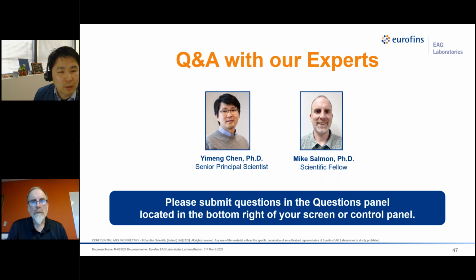So Atom Probe data acquired from pure or close to pure metallic samples contains some degree of crystallography information, but usually the Atom Probe data itself is not enough to determine the type of crystals or the orientation. Orientations, yes, but the type of crystalline structure is not sufficient. So that's why it's usually recommended to combine Atom Probe with TEM. That's why we put a lot of effort into correlative analysis with TEM.